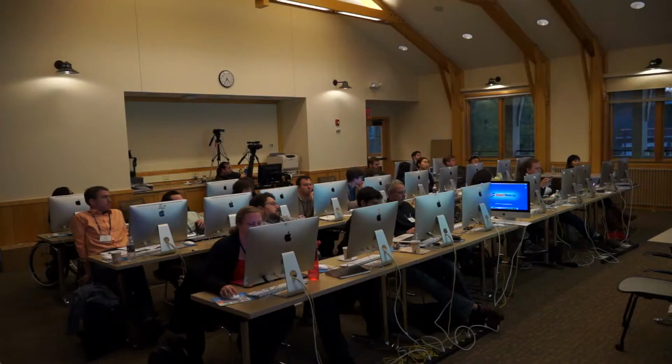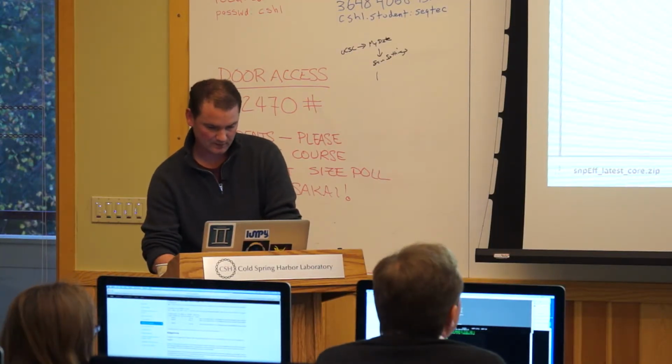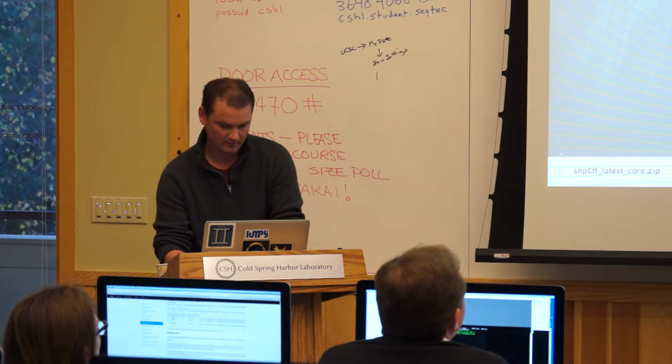Yeah, did you have a question? I was wondering what's modifier. So modifier, they have a whole website on that. That's a good question. Let's go take a look. It's not a simple answer. There's a bunch of different sequence ontology terms for that.